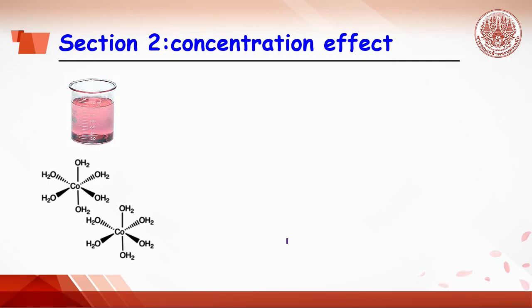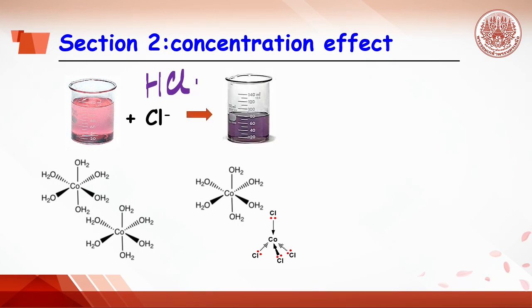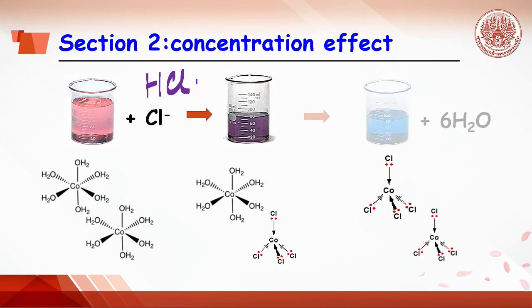Section two is aimed to see the color change by shifting the equilibrium position when the concentration is involved. Start from pink solution of cobalt ion. After adding hydrochloric acid, chloride ion will replace the water molecule to get blue color. Pink and blue color will be mixed and purple color is obtained. Finally, when chloride ion replaces all water molecules, blue color appears. However, when water is added, the blue color also changes to pink.